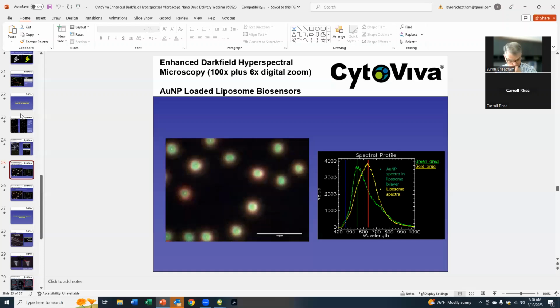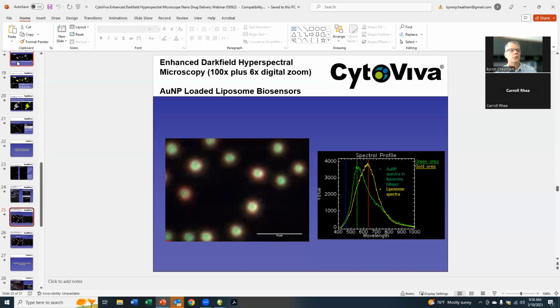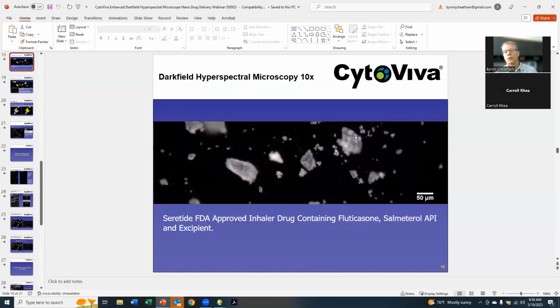Thank you. Emma said, would you mind to quickly discuss the working principle? How many spectra can be obtained at a pixel point in around one minute of detection? If we go back to this sample here, we're talking about hundreds of thousands of pixels of data that's captured in under a minute.